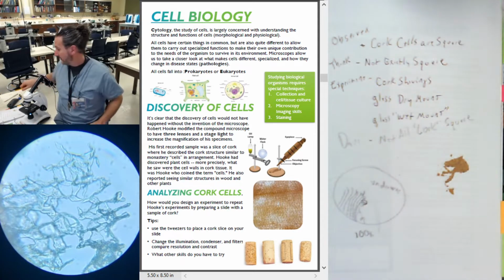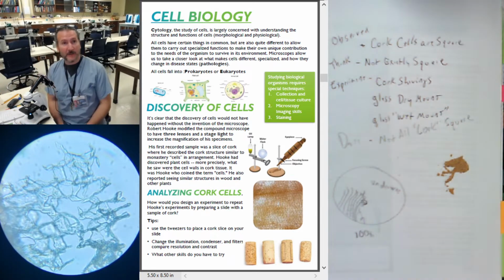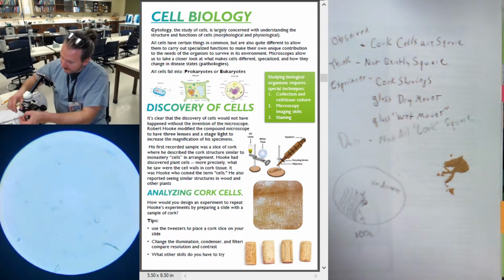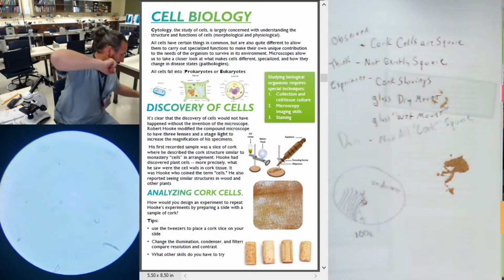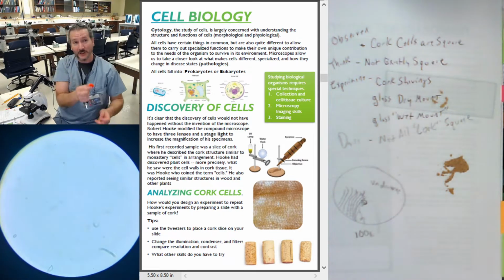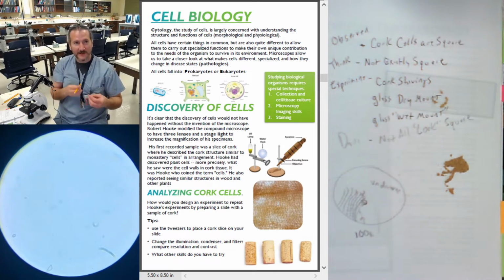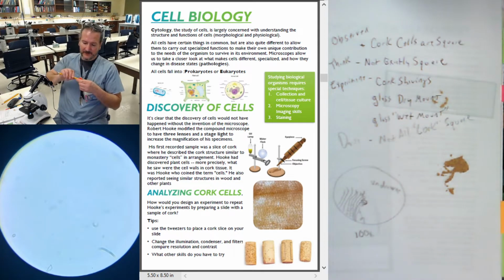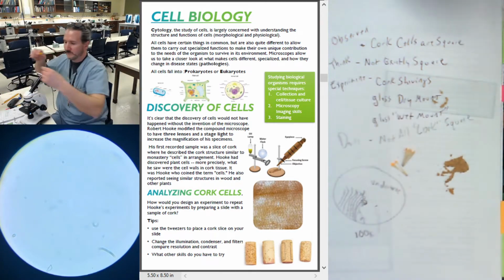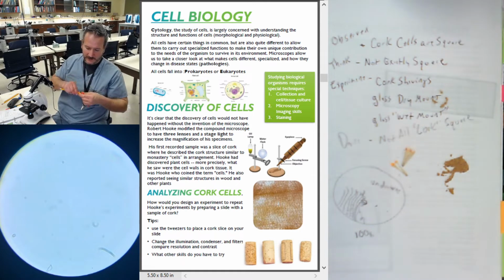So I could go back and I could experiment with a drop of iodine, drop of methylene blue. What I'm going to do right now is I'm going to flip, just for time, you can pause and do this, but I'm going to flip that blade back over so that it's a regular pencil sharpener again. Notice I changed my color too. And I'm actually going to shave a little piece of the pencil. Doing it nice and lightly, not cranking in. Take a couple more thin shavings.